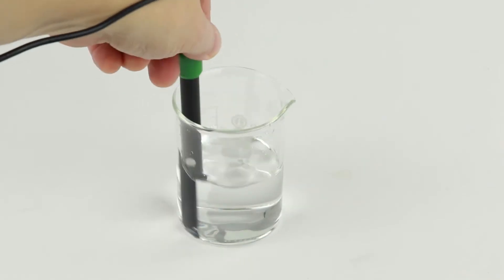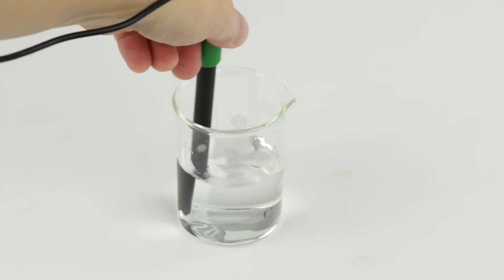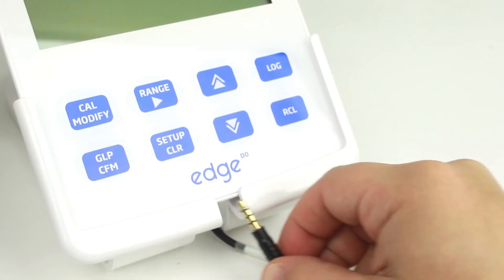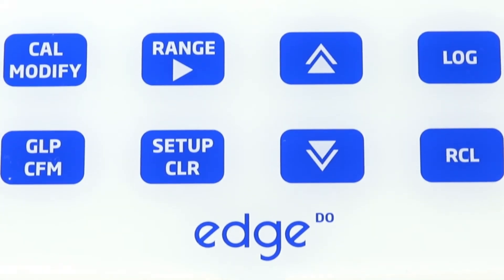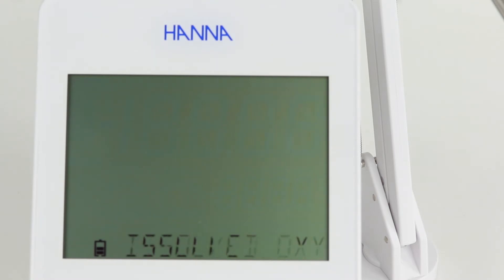Then rinse the probe after filling. The probe is now fully assembled. Inspect the bottom of the probe for air bubbles. If there aren't any, simply connect the probe to the meter and turn it on. Ensure that the probe is fully inserted into the 3.5mm connector. Once connected, the meter will automatically recognize the probe and enter dissolved oxygen measuring mode.